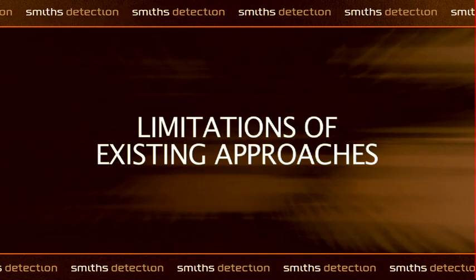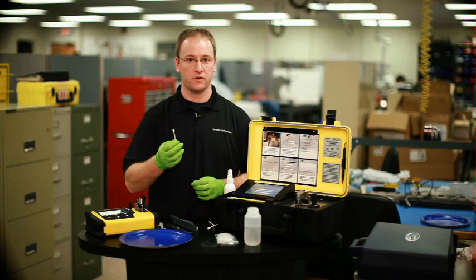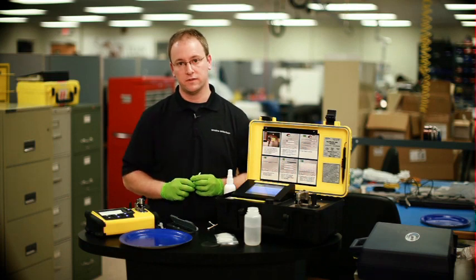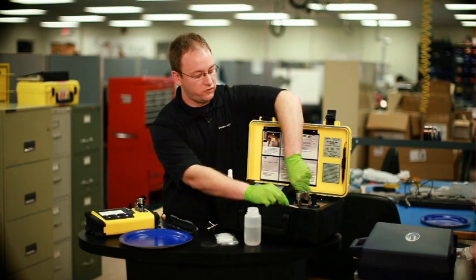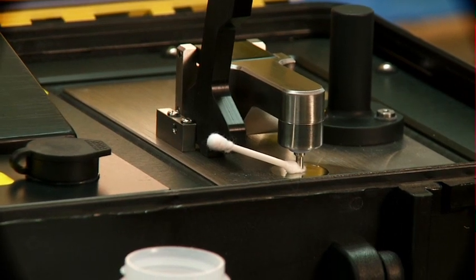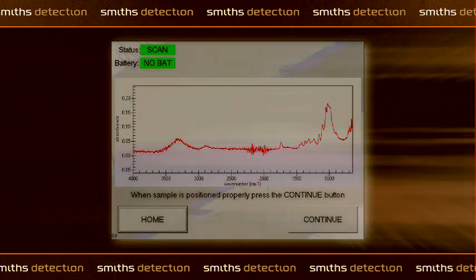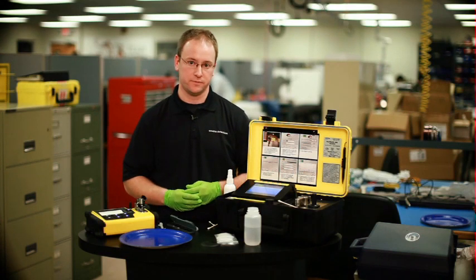So what a lot of first responders are doing today when presented with these types of samples is using a Q-tip or another cotton tip applicator device. And one of the main limitations of this is that the Q-tip itself has its own infrared absorption signature. And so if I place that on the sensor of the HazMatID, I see absorbance peaks show up in the signal. And those peaks are going to interfere with what I'm trying to analyze. That will lead to poor detection sensitivities and inaccurate results.